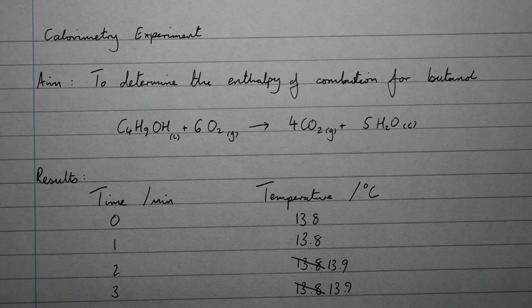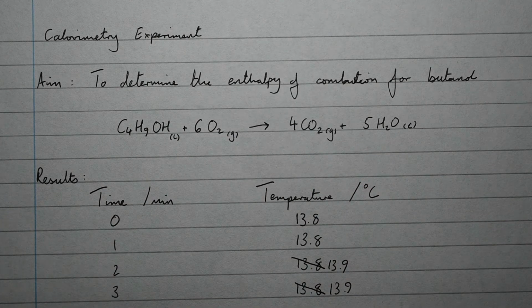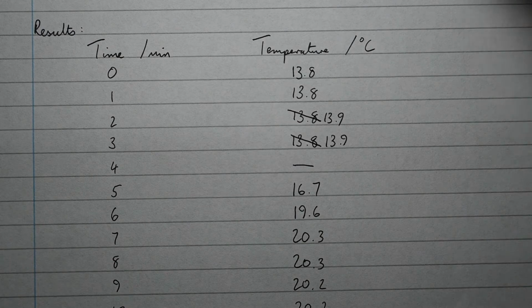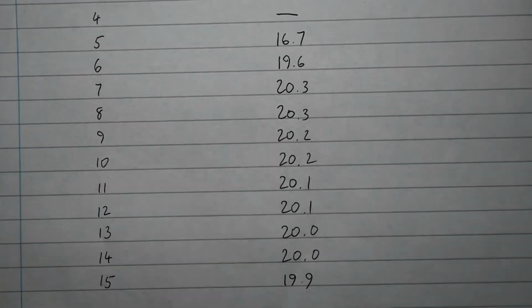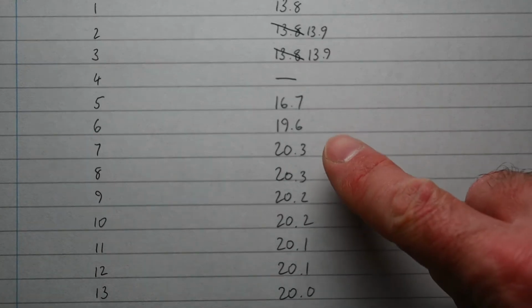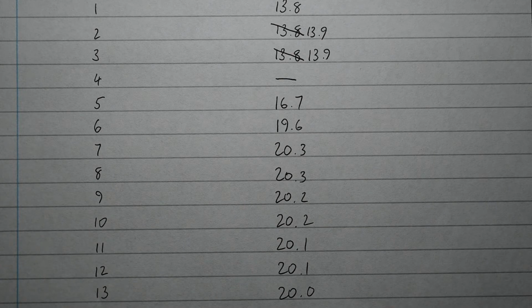Okay, so here's our results written out. We've got the equation there between butanol and oxygen for that combustion, and then we have our results. This one we took readings all the way up to 15 minutes, without a reading recorded at 4 minutes, which was when I ignited the spirit burner.